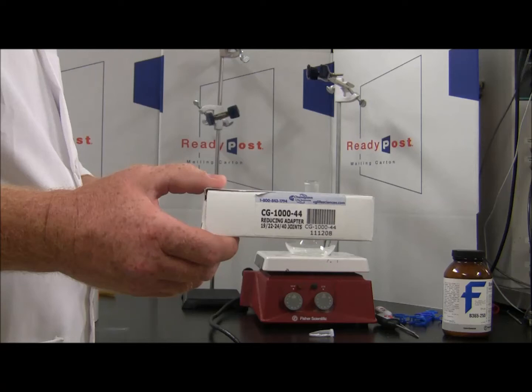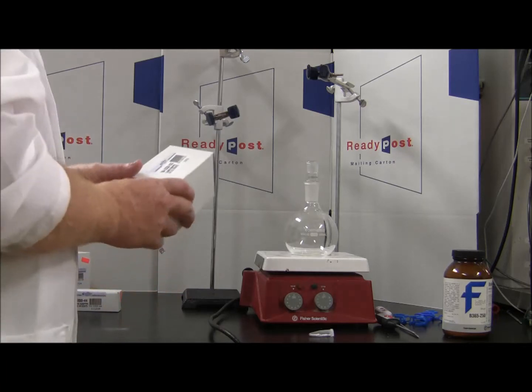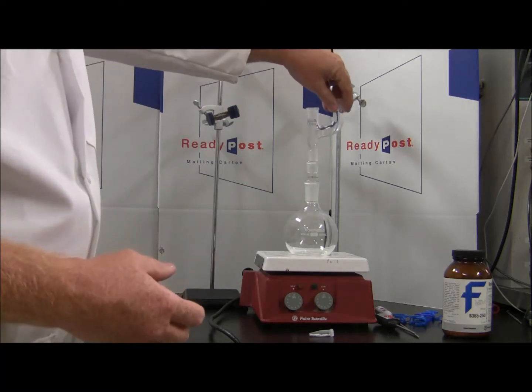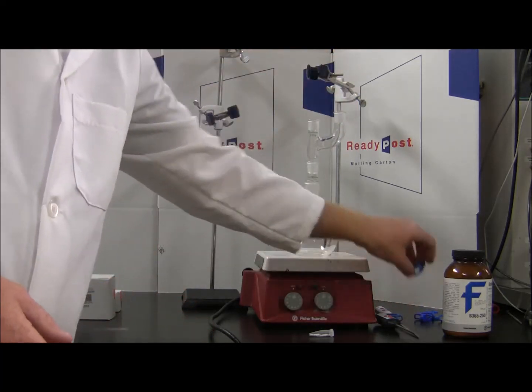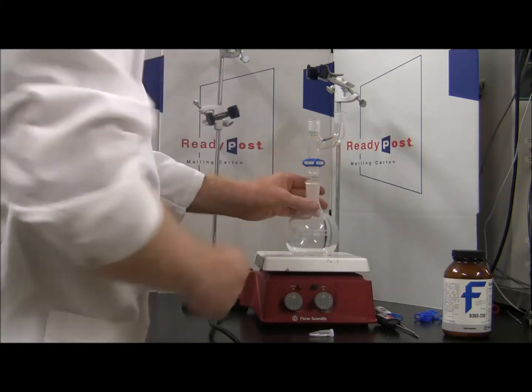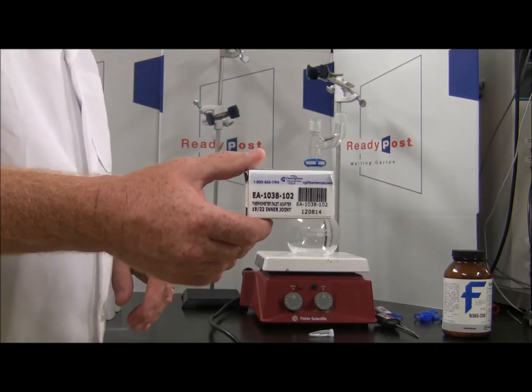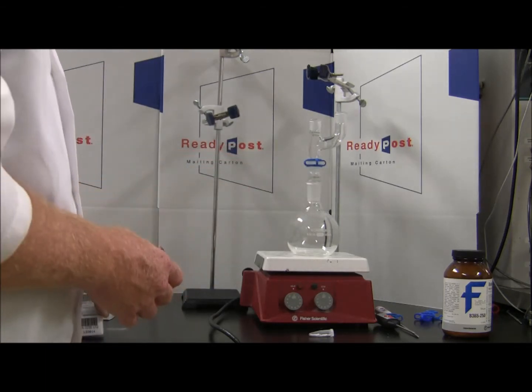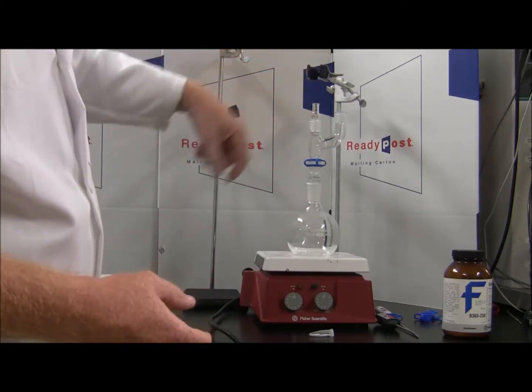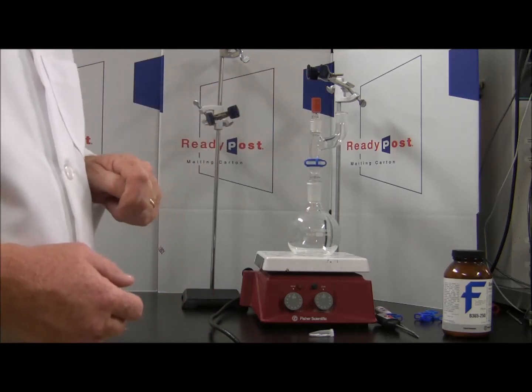Next, you're going to need the reducing adapter. It goes in on top, and then the Claisen adapter goes on top of that. As you assemble this, the kit came with a number of clamps to hold the joints together. So here's where we'll use our first one. Your kit also came with 2 thermometer adapters. The first one we're going to use right here. Put it in so it's straight all the way down in. Your thermometer is going to go in and come down and measure the temperature at the top of the flask.